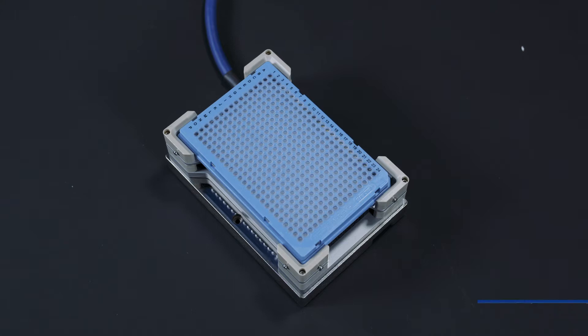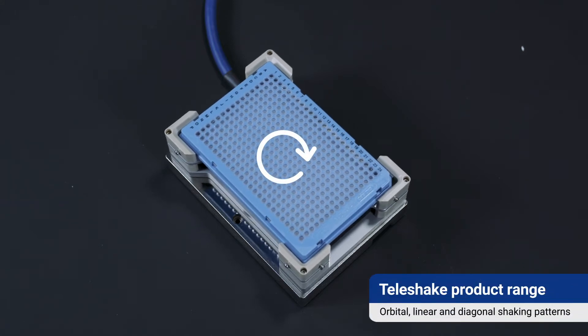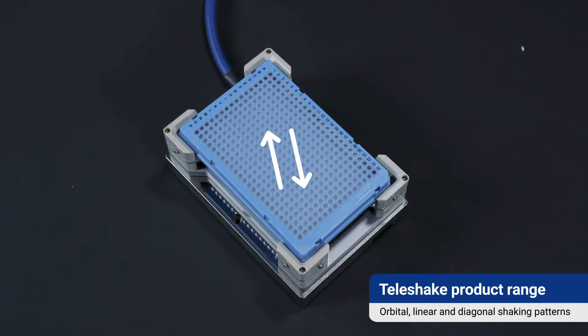Our tele-shakers are easily adjustable and can provide orbital, linear and diagonal shaking patterns.